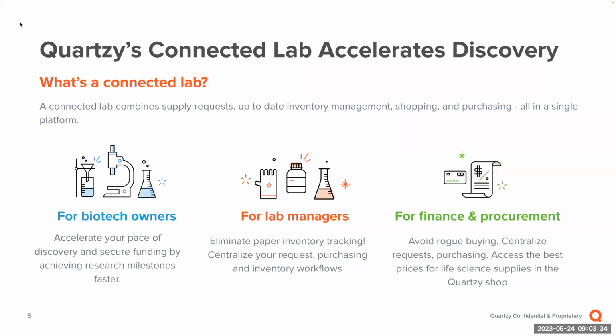All right, so Quartzy's Connected Lab. So what is a connected lab? So our goal with offering these integrations is to help build the connected lab. So a connected lab combines the ability to shop for and purchase supplies, as well as track orders and inventory, all while keeping all the parties informed and up to date.